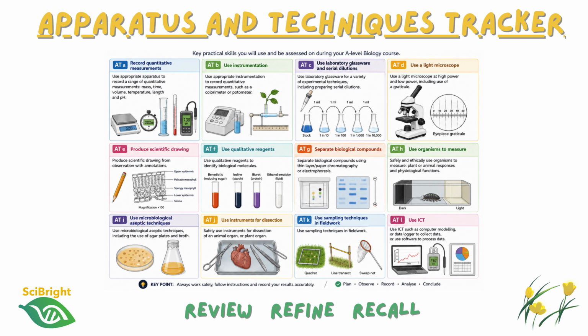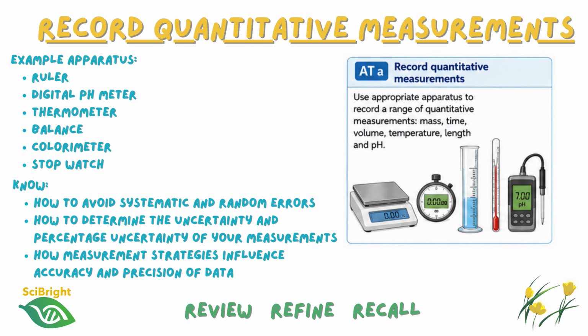You'll develop many of these skills across your required practicals across the course. However, the examiners will include 15% of marks asking you to show knowledge of the practical skills that you've developed. So let's work through our list.